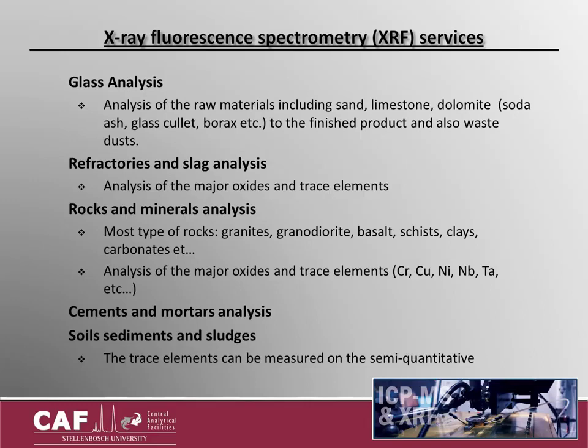At our lab, we generally analyze glass materials, raw materials including sand, limestone, dolomites, refractory slags, and then we can do complete whole rock analysis on any type of rock sample for major and trace elements analysis. We also often do cements and soil sediments and sludges.